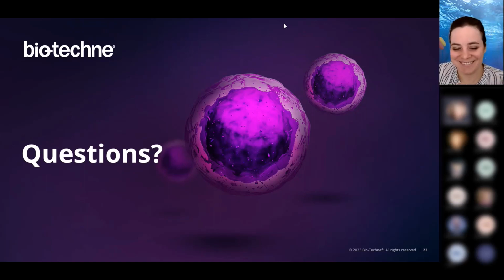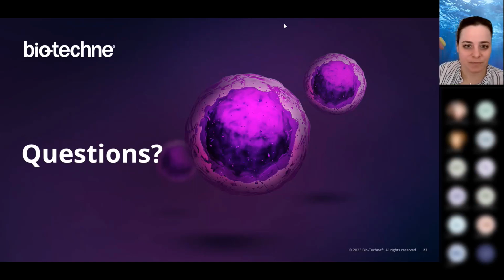Monica, do you have any suggestions of how the reagent might be prepped or how to increase the reproducibility and stability of the reagent, or maximize the stability? For the total protein assay or protein normalization? Yes. So these kits are one-time use. You would prep them the day of and then load them into the plate with the rest of your reagents, or any of your other simple Western boxes will take care of the rest for you.